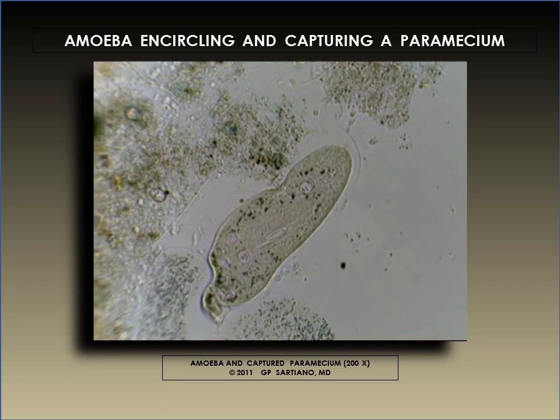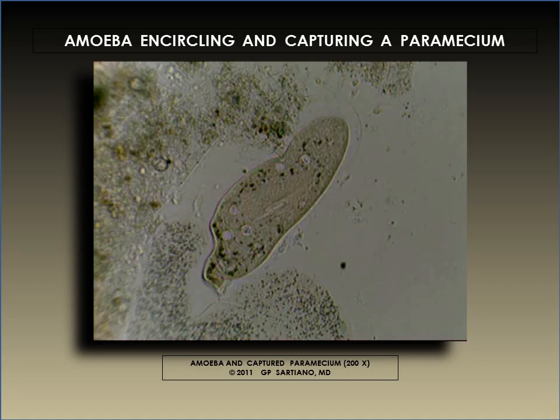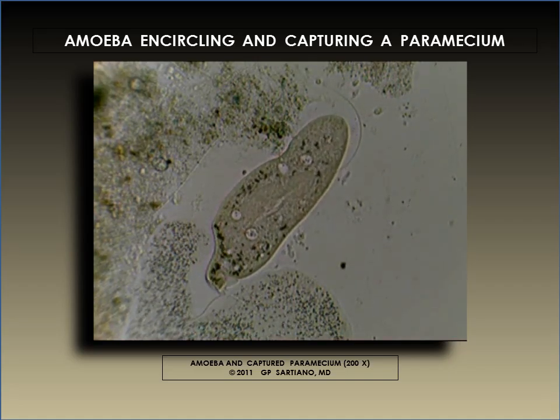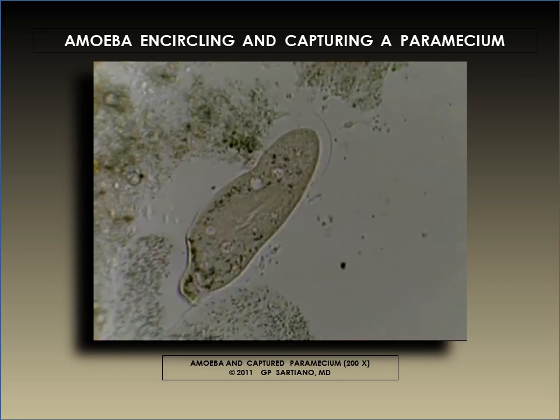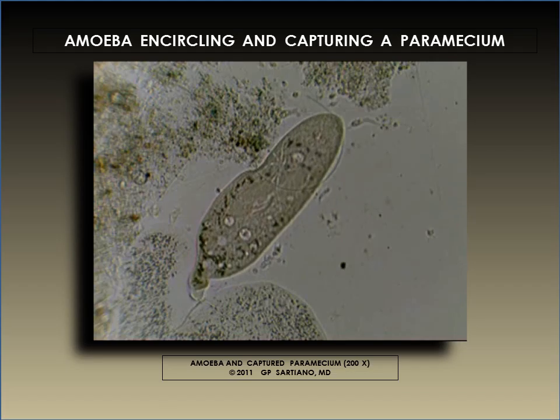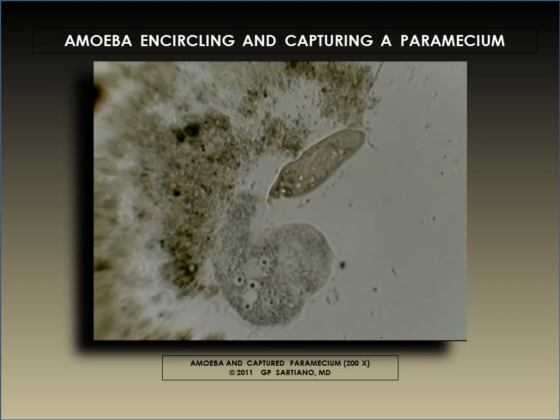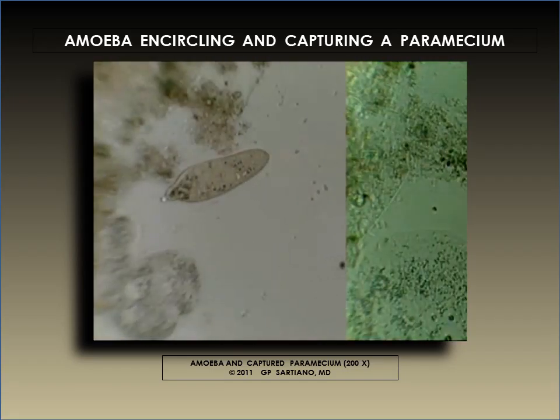Seen from low power, it is possible to assess the paramecium's successful escape. Nonetheless, as it moves away into the surrounding fluid, it appears flattened, misshapen, and sluggish. However, the organism as a whole has survived and can undoubtedly regenerate and refurbish its form, appearance, and function.